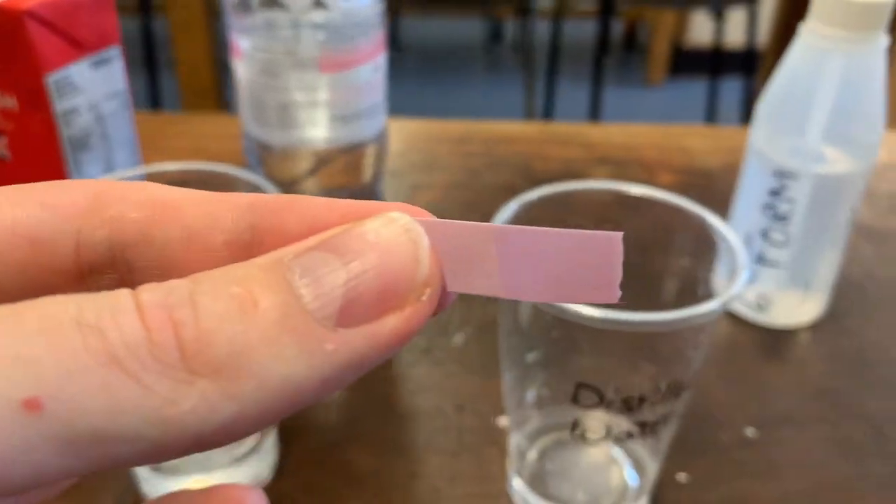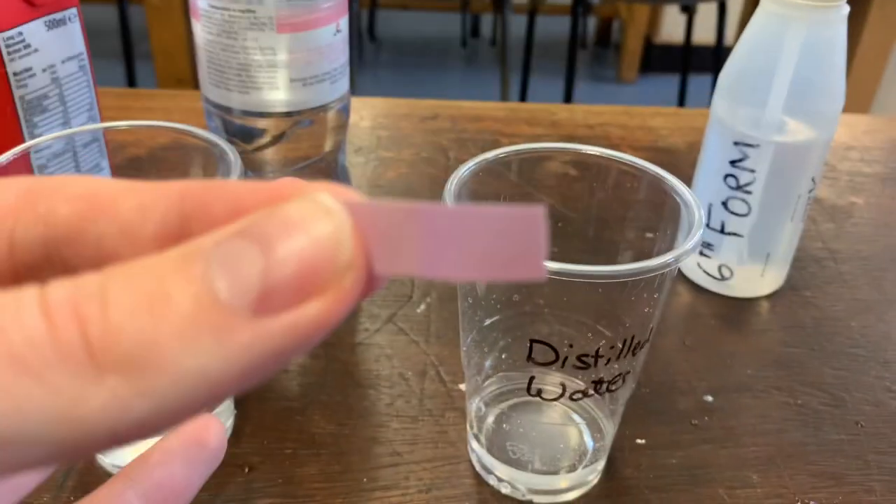You can see that it stayed the same colour and so this is neutral. There are two kinds of litmus paper. We've got red litmus paper, which can test if something's basic or alkaline, because it will turn blue. Or we've got blue litmus paper, which will turn red if it's an acid. So let's test all the things — I'll test with red litmus paper first, and if we get a blue colour change, then we know that it's going to be an alkali or a base.